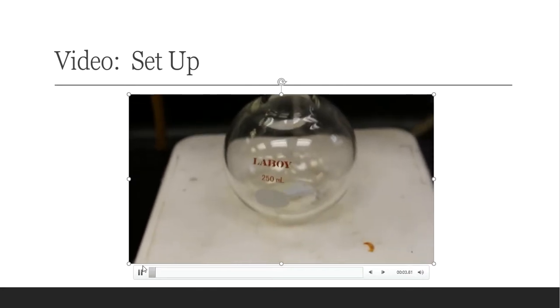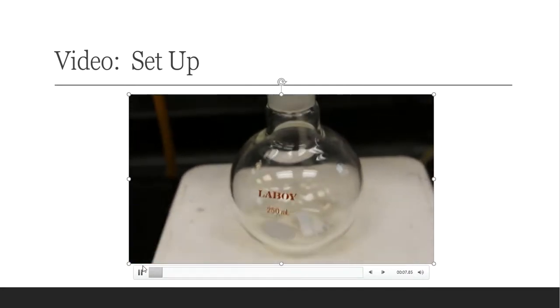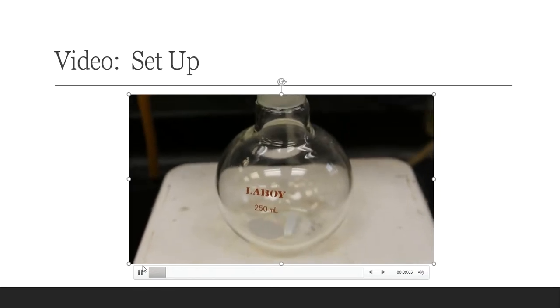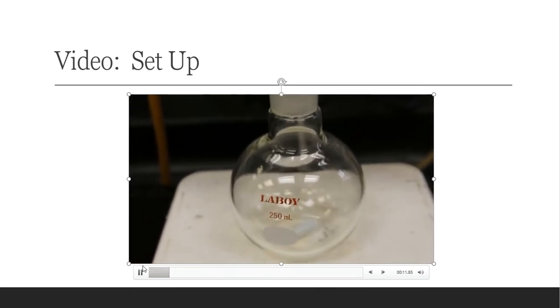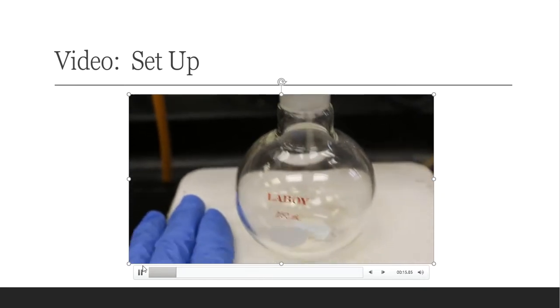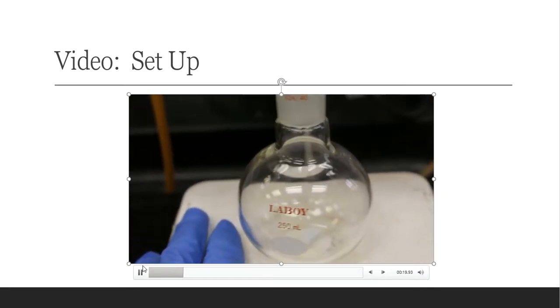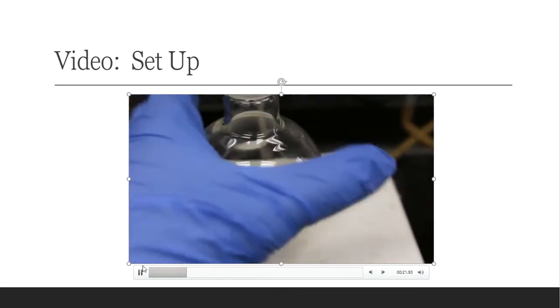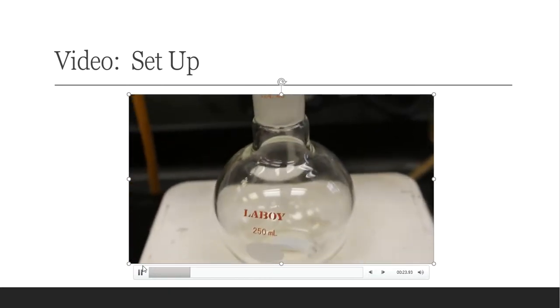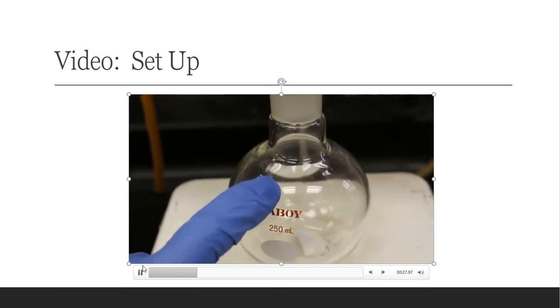Okay, so this is the setup for the Soxhlet extraction for my peanuts. What I have here is a 250 milliliter Florence flask. It's Florence because it has a flat bottom, and I'm putting it onto the surface of a flat hot plate. So this is not a true round bottom flask. All of my ether, or my extraction solvent, will go into this flask and it will begin to heat up.